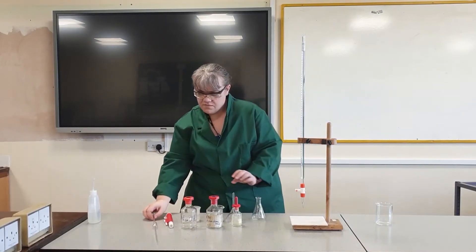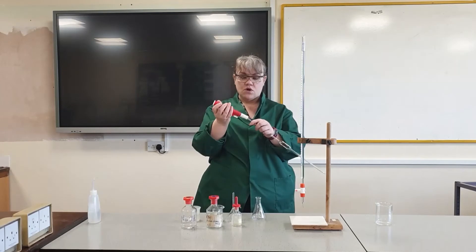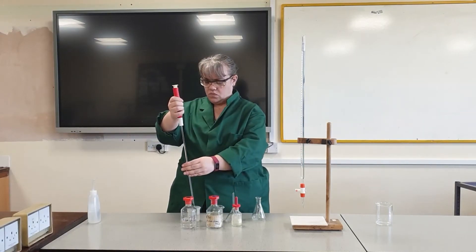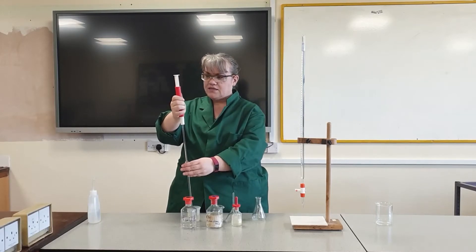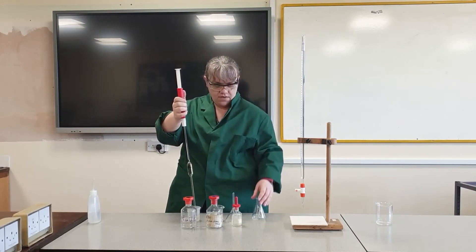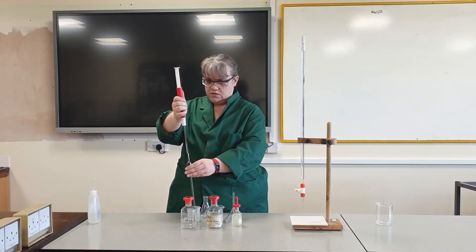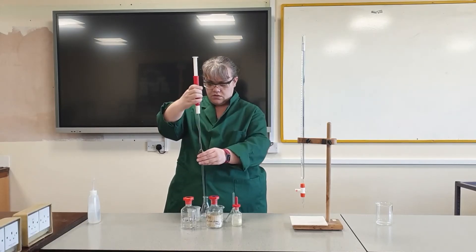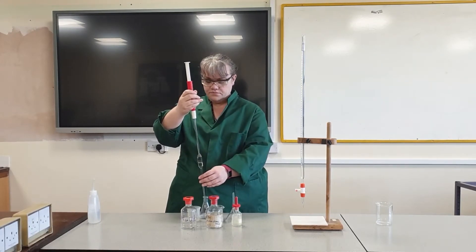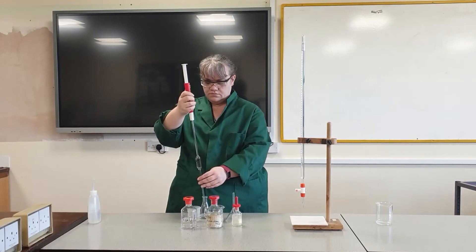I'm now going to put 25 centimetres cubed of my alkali into a conical flask using a pipette filler, drawing up the alkali until the meniscus of the solution is sitting on the 25 centimetres cubed line. And then I will transfer it into a conical flask.